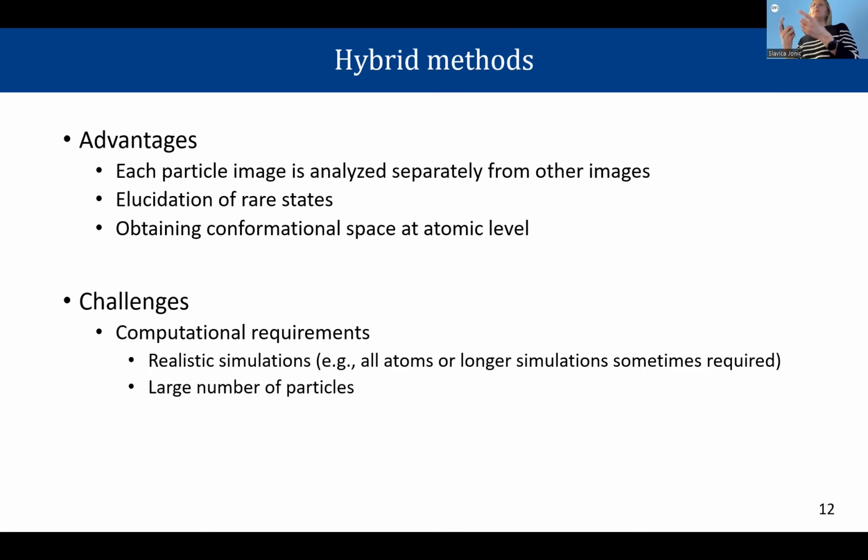But I believe this is really a combination of two factors. We are not using all atoms; we are using this coarse grain model. And the MD simulation we are running is also coarse grain, called the Go model, carbon alpha Go model. Probably the combination of the two means that we can use short simulations and go fast.